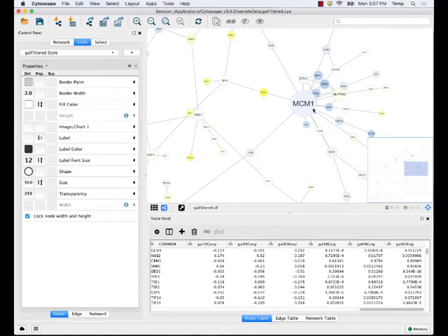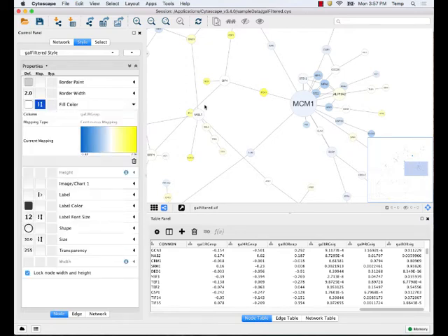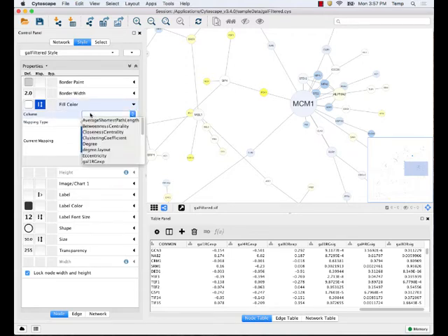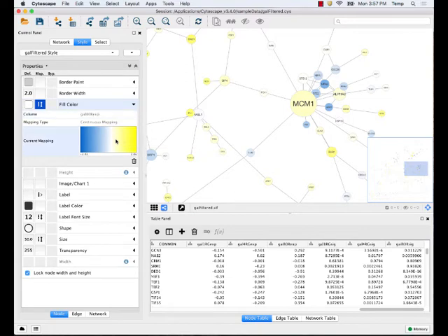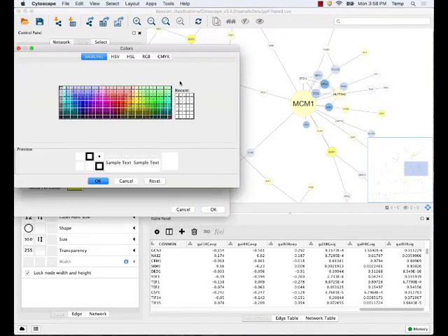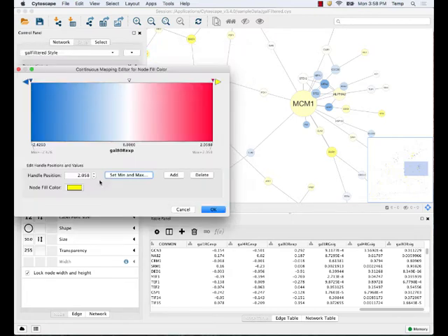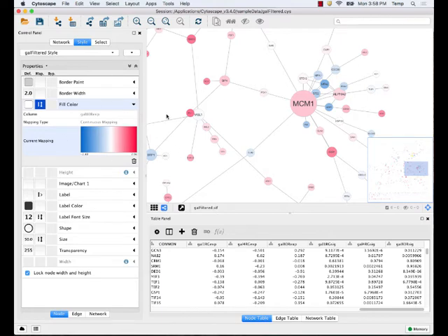I'll take these expression colors — somebody already mapped these in this session file. If I click on 'Fill Color,' that's the color of the nodes. You can see that someone took gal1 expression values and used a continuous mapping function to map to a blue-to-yellow gradient. Let's change it to gal80 expression values — and now everything updates. The gal80 expression values are mapped to color. I can double-click to change it: if I don't like yellow, I can change it to red. This is highly configurable.